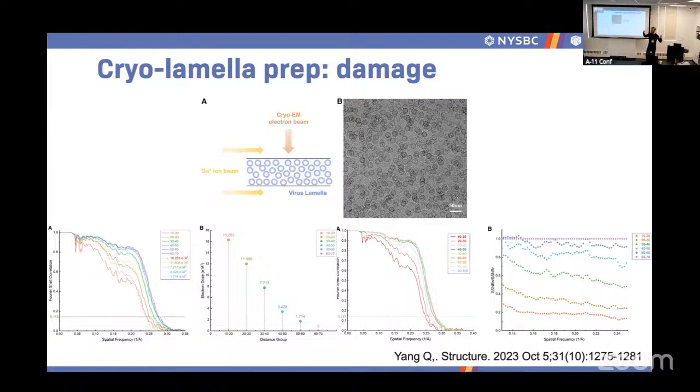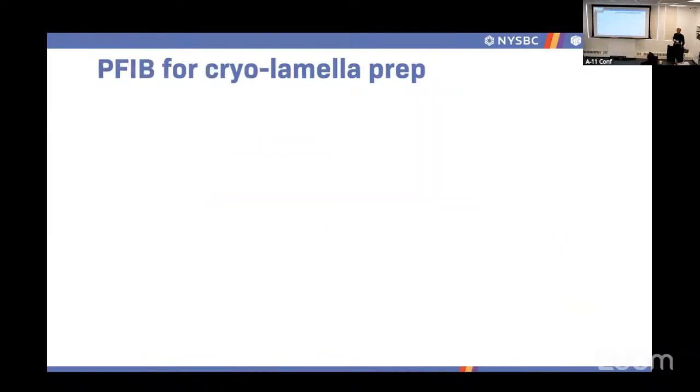stack, basically. What I mean here is that you'll be able to get to high resolution. You'll just need a lot more data. That's all. So if you're looking for high resolution, who cares? Just use whatever ion. Doesn't matter. If you look for something very, very rare, maybe you're going to have to care about this.